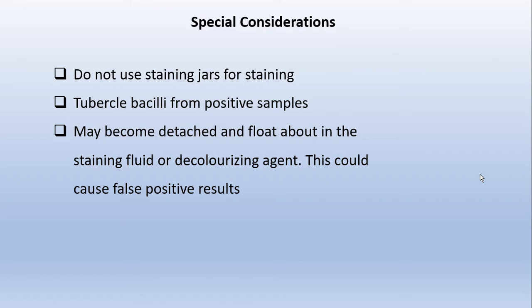Then when you add slides into the staining jars, the floating detached particles can attach to the slides. This could cause false positive results.